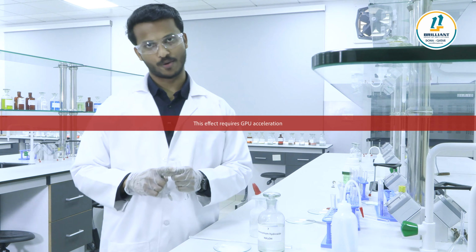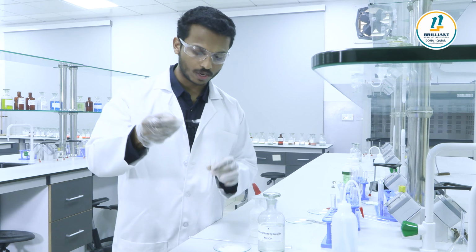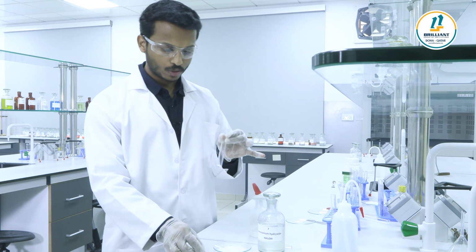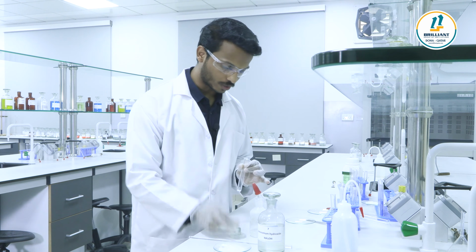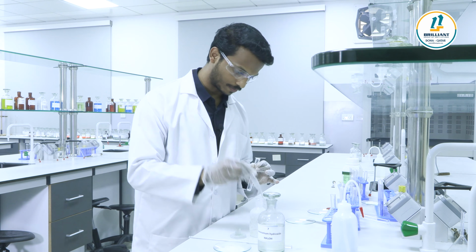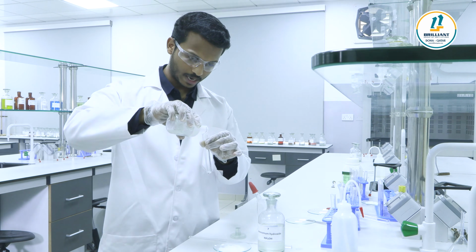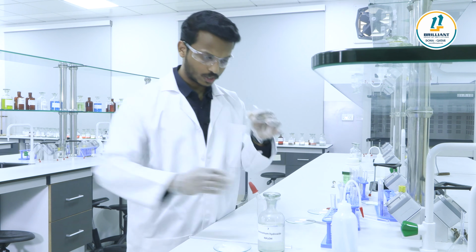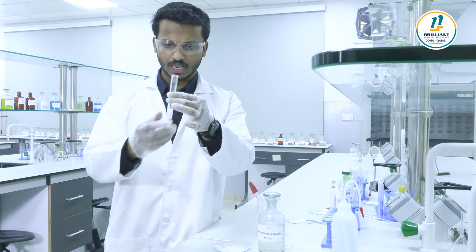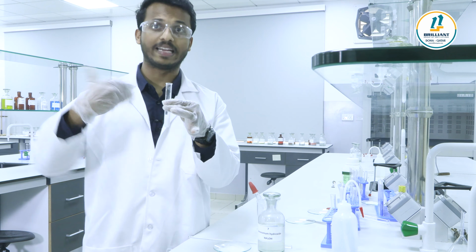Let's go to the preliminary and confirmatory test for chloride ion, Cl-. First of all, the preliminary test. Take a pinch of salt into a test tube. To the salt, we add a few drops of concentrated H2SO4. Just wait for a few seconds, and we can see that a colorless gas is generated. The colorless gas becomes denser.